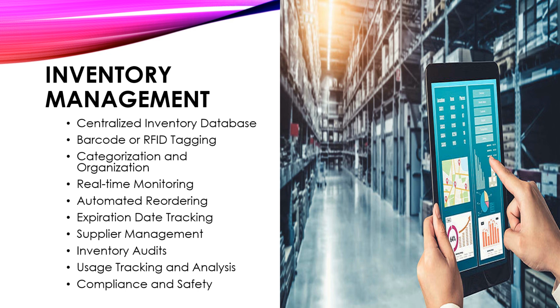Compliance and safety. Ensure compliance with regulatory requirements and safety standards when handling and storing inventory items, particularly hazardous chemicals and biological materials. Implement proper labeling, storage, and disposal procedures to minimize risks to laboratory personnel and the environment. By implementing these best practices, laboratories can streamline their inventory management processes, improve operational efficiency, and ensure the availability of essential supplies for conducting experiments and research.